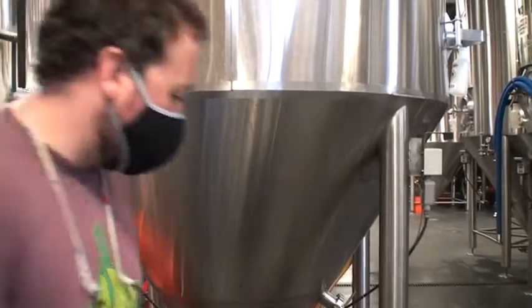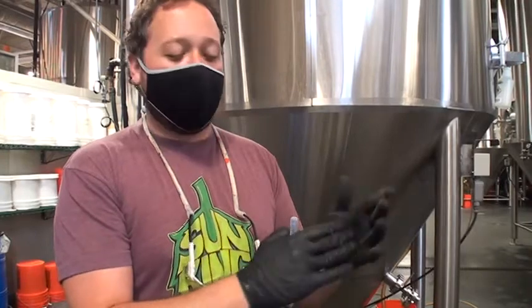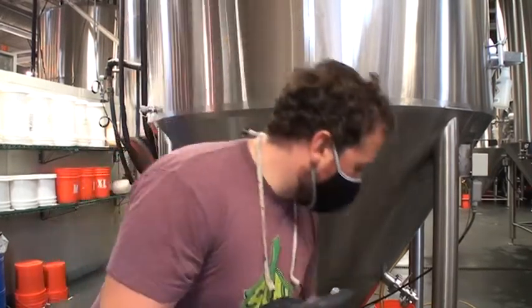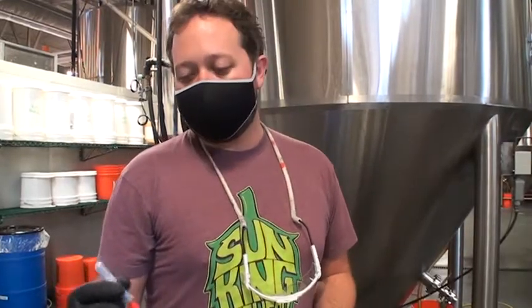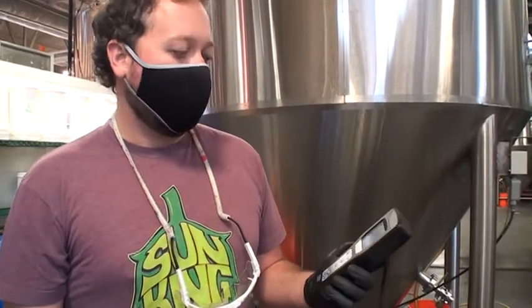A fun experiment, too, in the time of a global pandemic: people wearing gloves. Gloves are great to protect your hands from outside elements, but gloves can still get dirty. There's still things on gloves. For example, you should be pretty clean. You've been in a lab, you've been doing clean stuff all day. I sprayed my hands with isopropyl alcohol before we started the yeast stuff. So, these, you would think these would be clean. We shouldn't see a lot. You probably have touched some doorknobs, maybe. Handles, grabbing the brink itself. You grabbed my pH test strips, yep, which have been hanging out in my brewery.